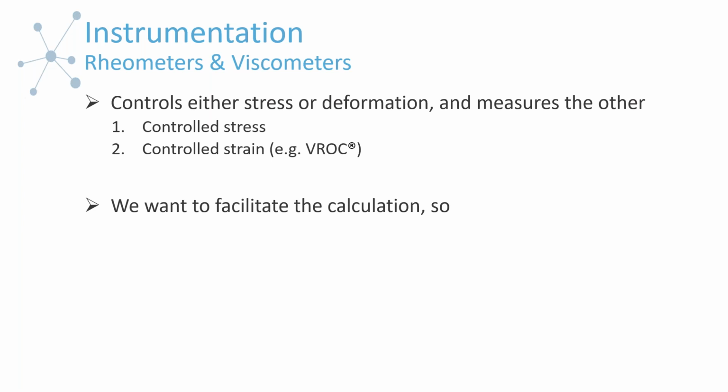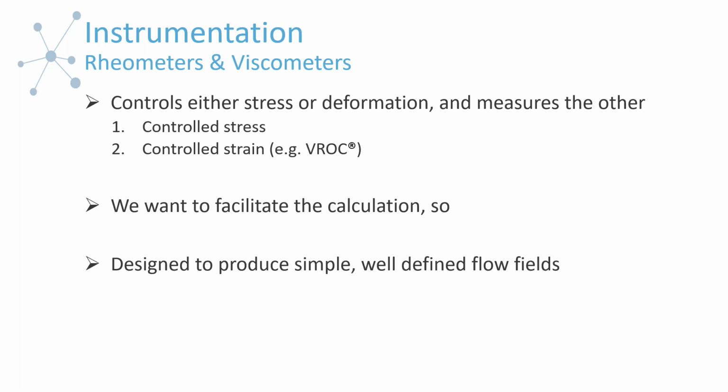And so also to keep in mind, rheology instrumentation is intentionally designed. One of the things that's intentional about it is that we know we're going to have to do calculations using fluid mechanics, as we just discussed, so you want to make this calculation as easy as possible. So we want to facilitate this calculation. How is this done? This is done by choosing very simple geometries so that the flow field is well defined and simple as well.